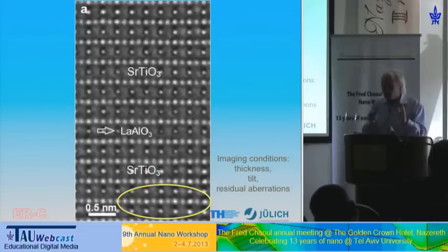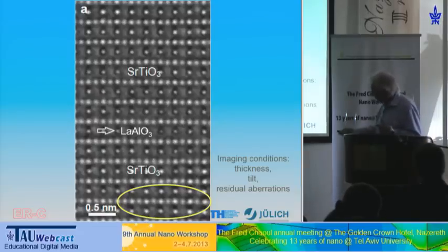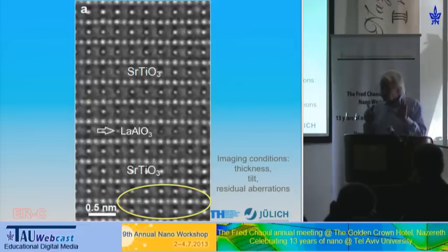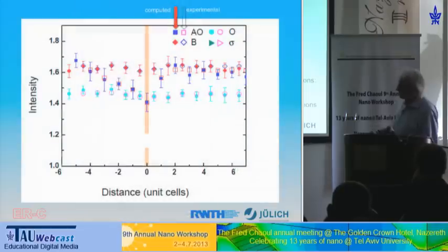Stability becomes an issue, so new aberrations come in. These residual aberrations can be corrected when you do experiments in this perfect area. That means we can numerically, a posteriori, correct these aberrations. That's one of the difficult parts of this type of work. And with this, we then go to the problematic area.